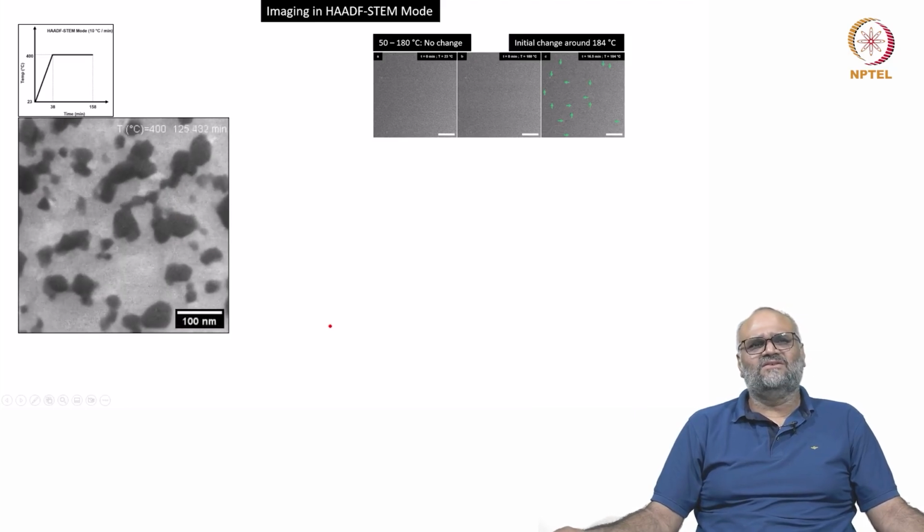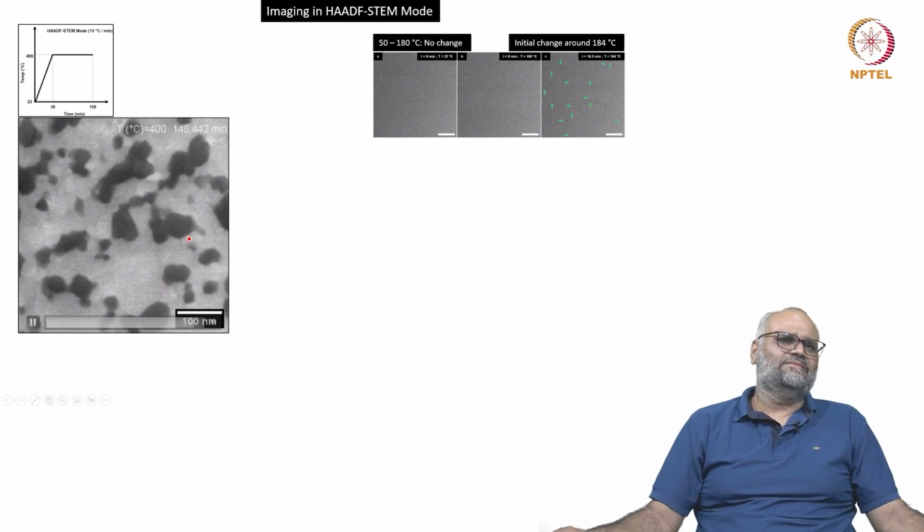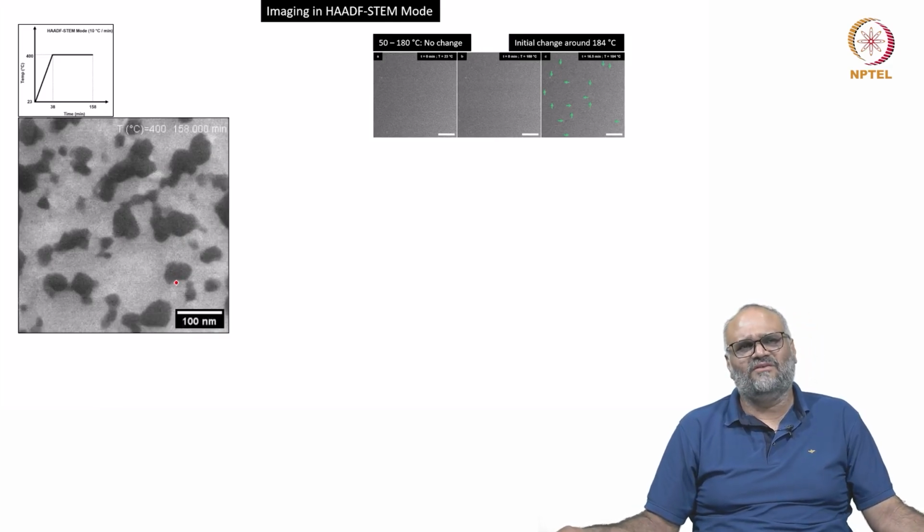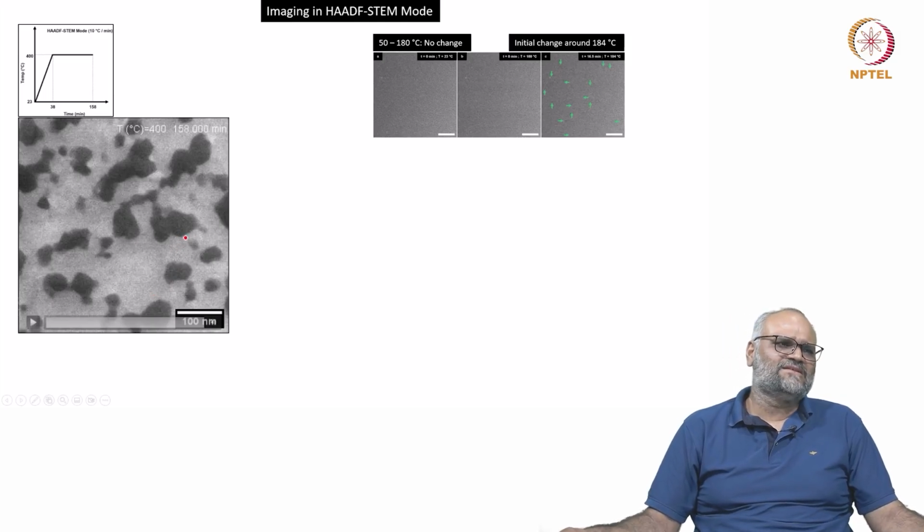And in fact, in the tutorial I tried to show you how the values of the domains that are actually forming can be measured in real time. The example of this by aligning the movie and obtaining the domain sizes was already shown to you.